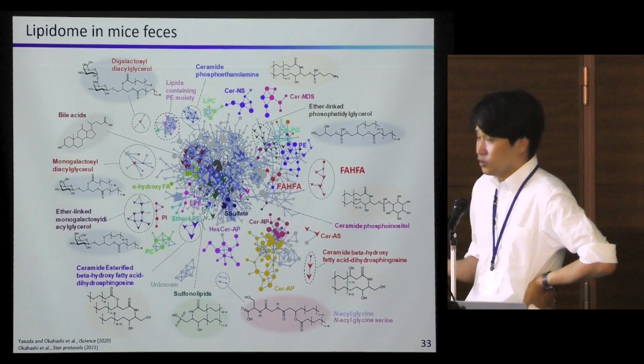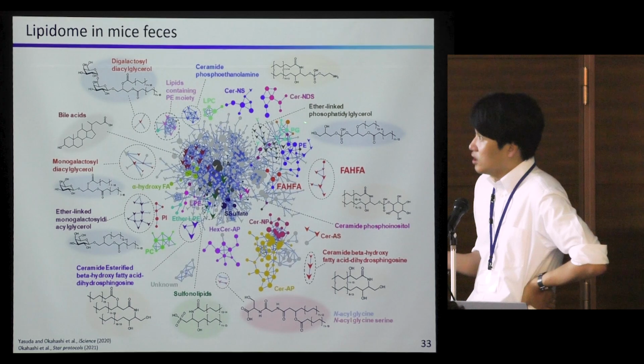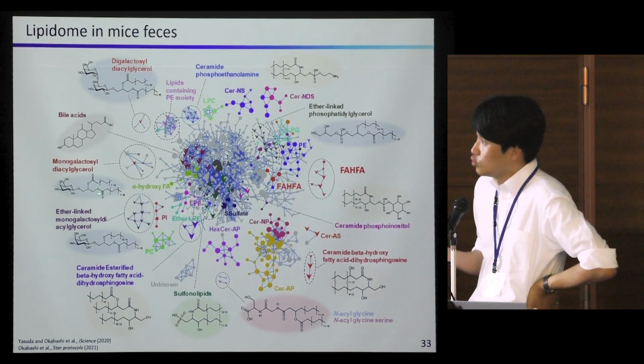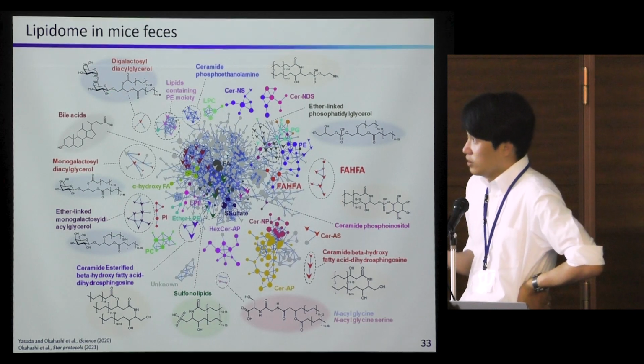And these molecules have unique features. For example, these phosphoglycerols, but their linkage to the acyl chain is not ester but ether type, and also the sugar-conjugated diacylglycerol shown here, and also ether type and di-sugar type are found.